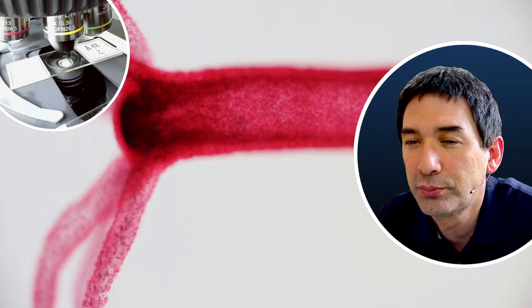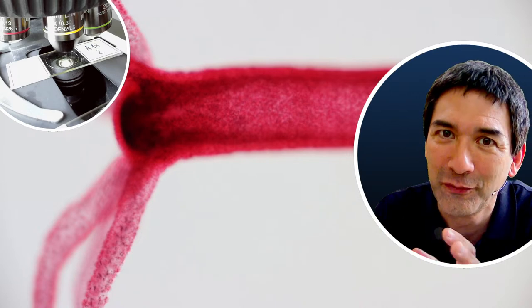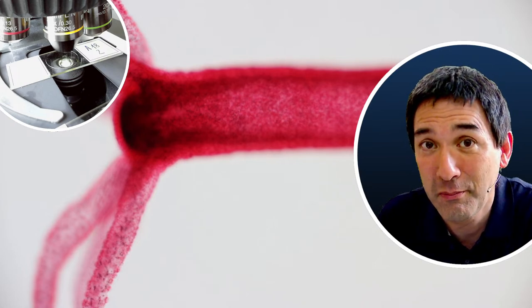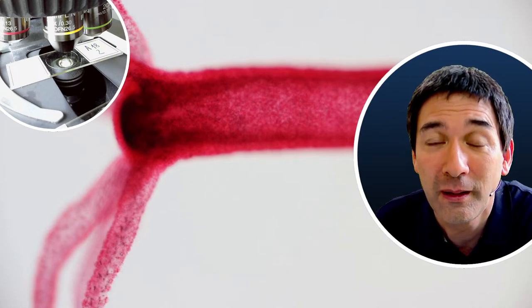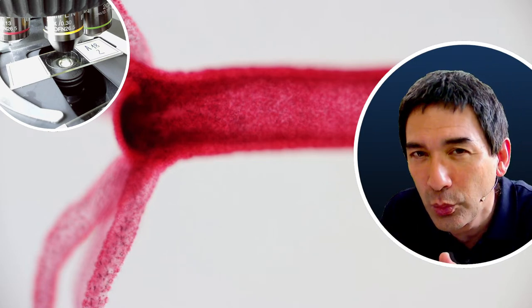Someone saw something in dirty water — brown or yellow, kicking up dirt, small and slimy. Very difficult to say because there are so many things, and the color of microorganisms also depends on the food they eat. I always recommend posting a picture or doing some Google research. There are online identification guides with drawings to help sort out what it could be.